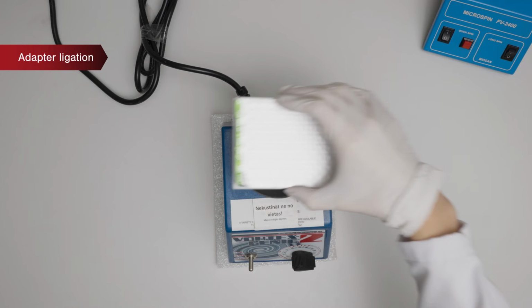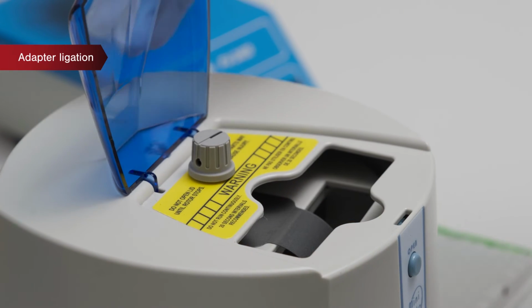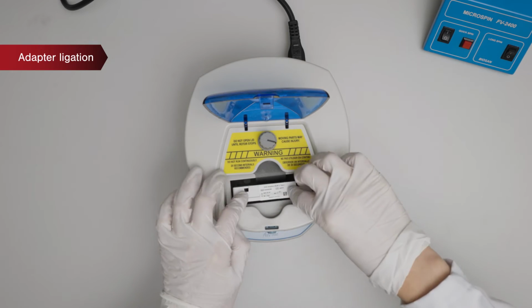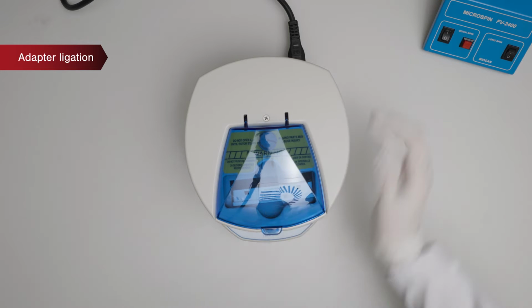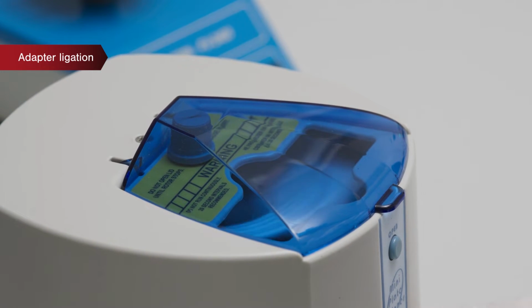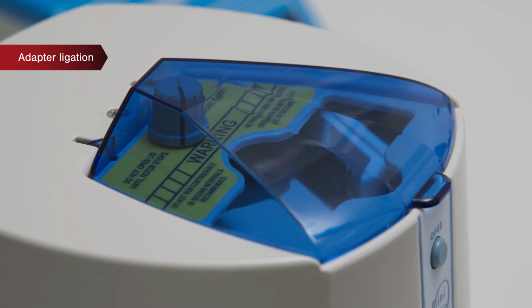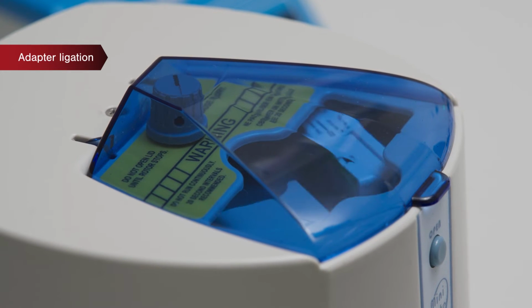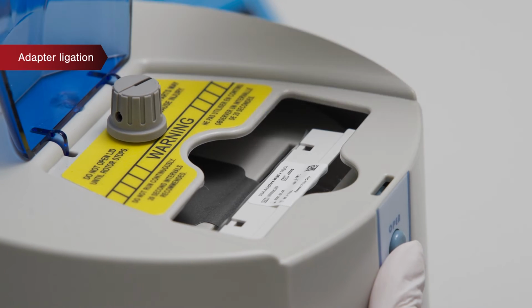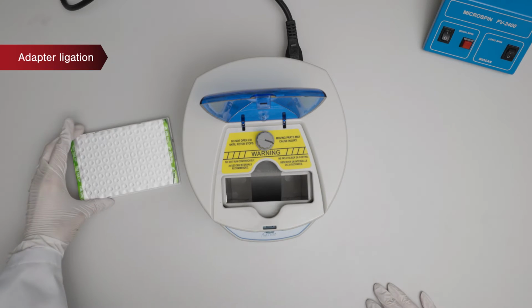Before choosing the adapters, please read Appendix D of the protocol carefully. Adapters are added based on sequencing strategy. Samples that will be sequenced on the same lane must have a unique adapter each. In addition, a full set of adapters needs to be used among all samples within one lane. The sequencing flow cell consists of 4 lanes. Adapters may overlap between different lanes, though not between different samples within one lane.